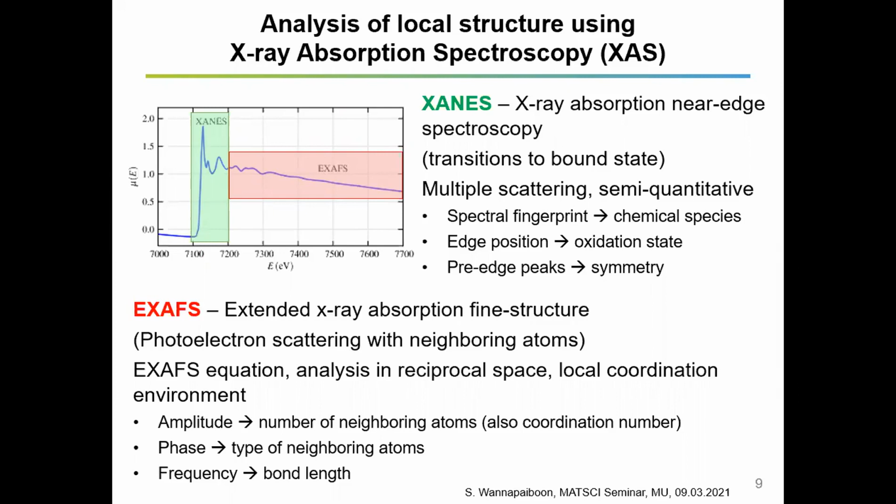And we also use quite a lot of information from the EXAFS part, the extended X-ray absorption fine structure, to get into the details about the coordination number and neighboring atoms around the target metals within the metal node, in order to identify the active site and also the binding with the target molecule that we would like to study.